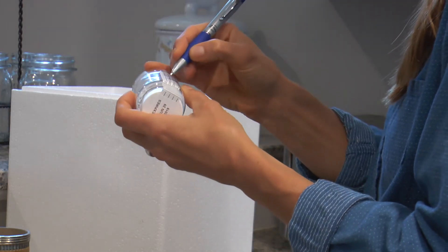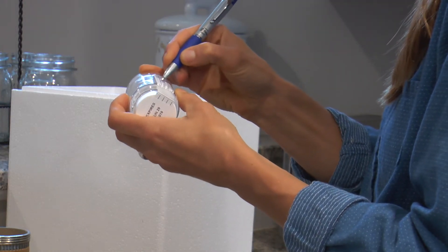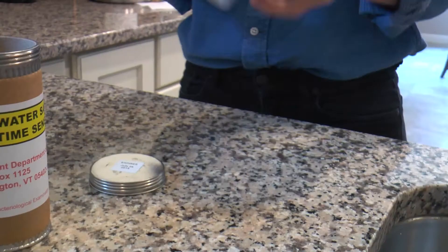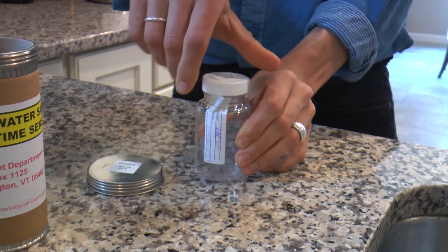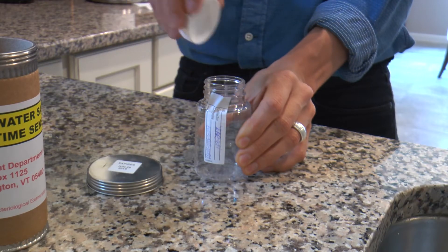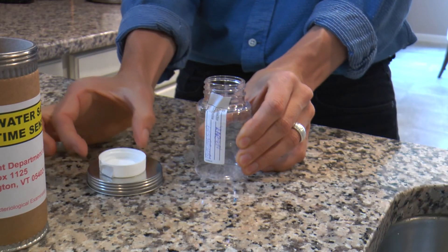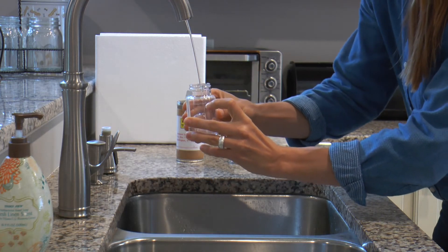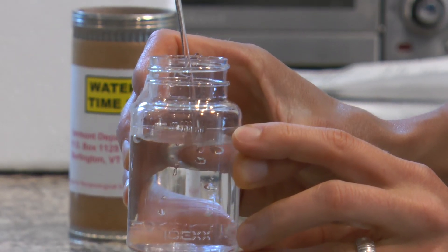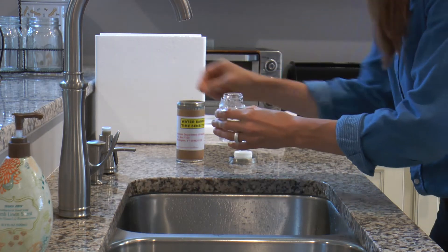While you're waiting, print your last name and phone number on the side label of the bottle. Remove the cap breaking the paper seal. Don't touch the mouth of the bottle or rinse it, even if you see a white powder or condensation inside. Turn down the water flow and fill the bottle just above the 100 milliliter line, then put the cap back on tightly.